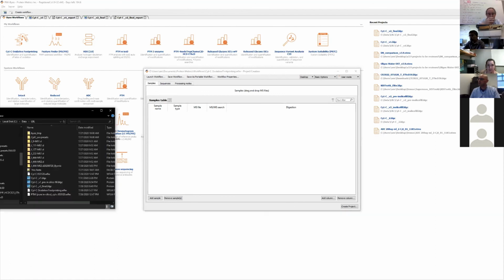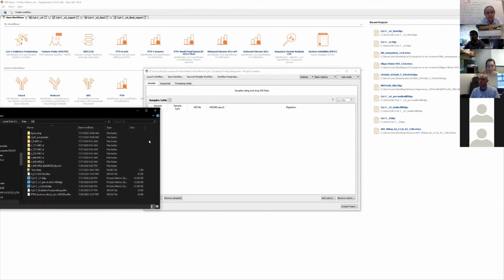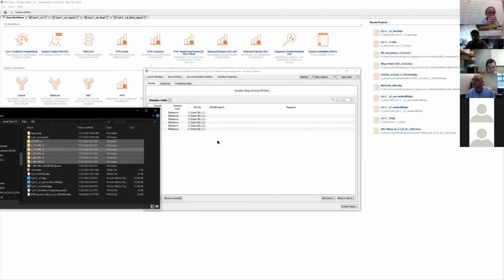What we're drag and dropping here are the raw data folders for Agilent instruments, which have a .d file extension. Bruker also has a .d file extension. Waters data files have .raw, and those are folders, and Thermo has .raw as a single file. Or if you have Shimadzu, I think it's an LCD file, something like that. Anyway, you just choose them all, whatever you like, and it can be a mixture of instruments too, that's not a problem. You just drag and drop them here. The first tab, the samples tab.